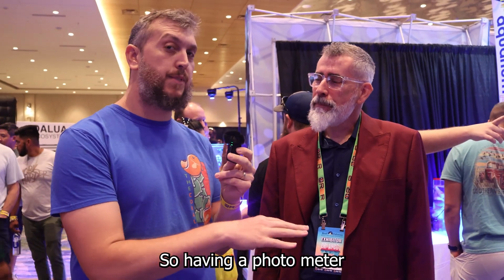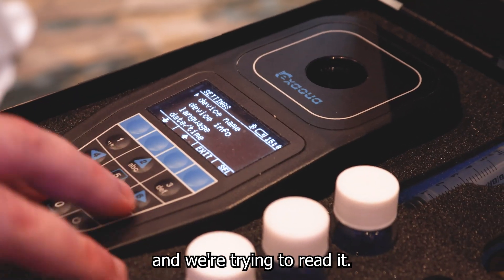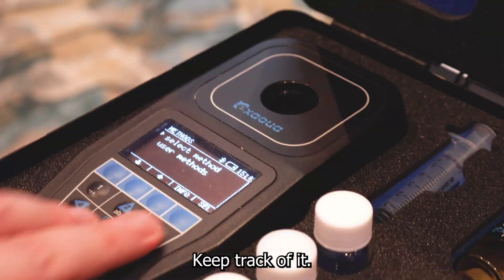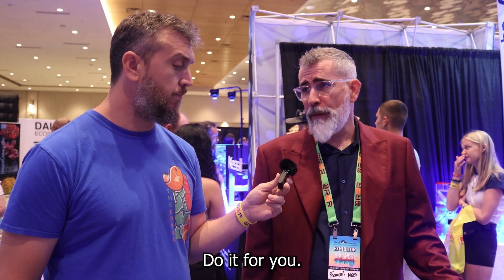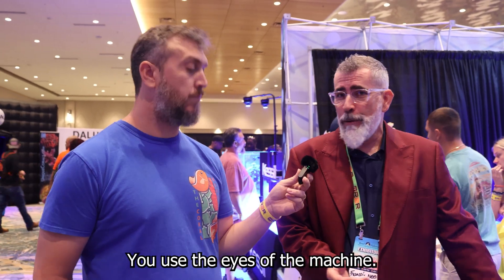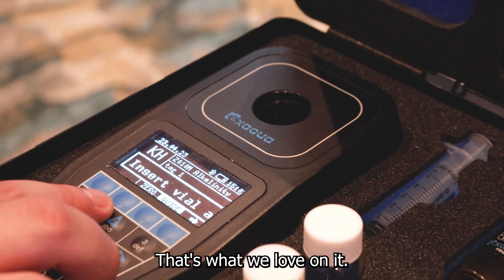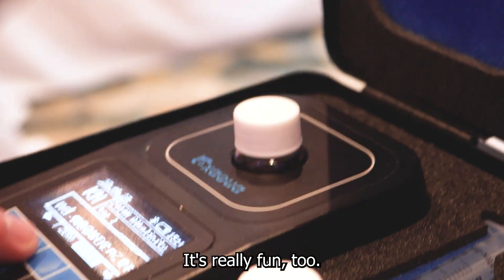Having a photometer takes the human error out of it — where you're trying to look at colors and read them yourself. This actually reads it for you and keeps track of it. You follow the guide and it does it for you. You're still doing the test, but you don't use your eyes; you use the eyes of the machine. That's what makes photometers great, and honestly, it's fun to do.